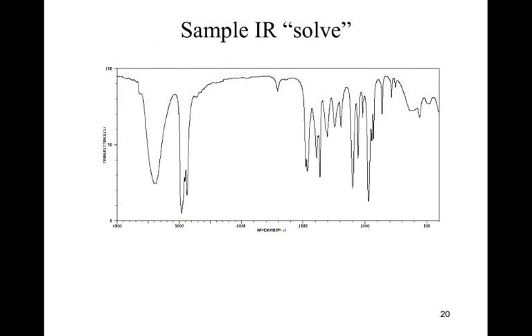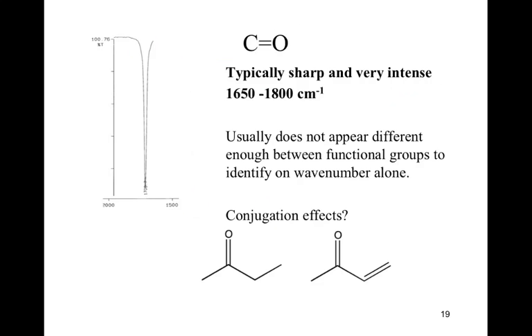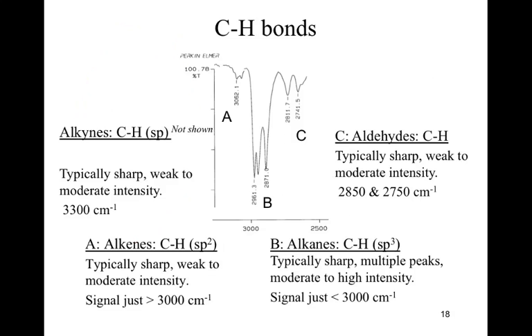Use the guidelines that are outlined a little bit earlier here. I went through and put them each on individual slides. Use these kind of images to match up what things you see, or really, unfortunately, what things you think you see until you're comfortable identifying them. Takes a little bit of practice. Hopefully that IR activity is within your grasp after this.